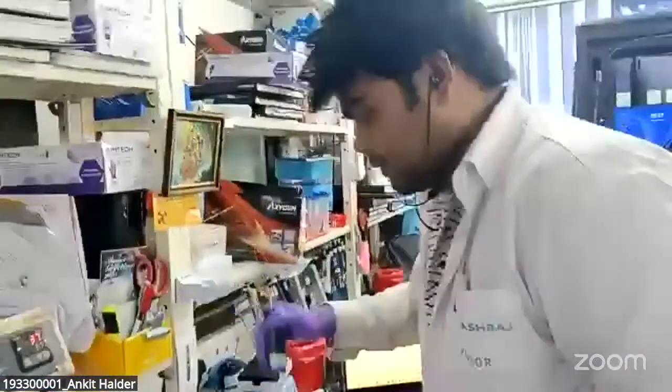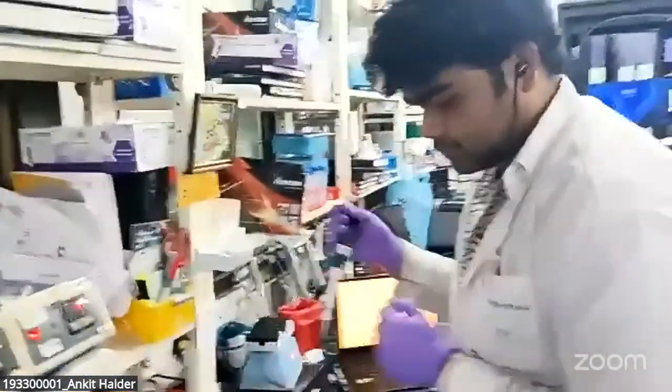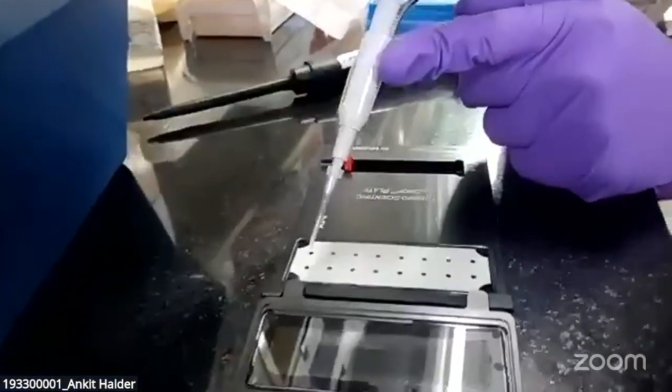Before starting the experiment, we also need to set the blank here. For the blank, we will use the FA. I'm keeping the blank here.